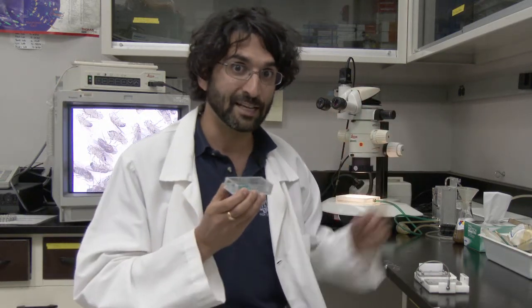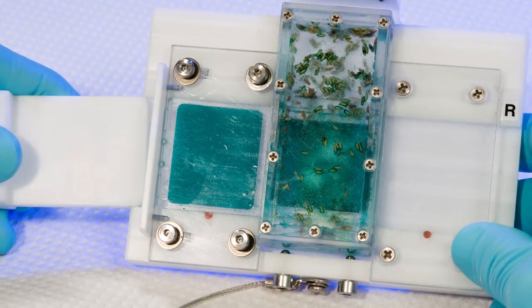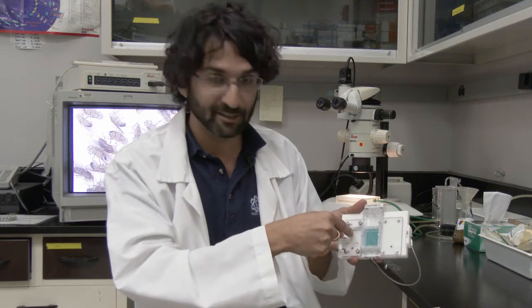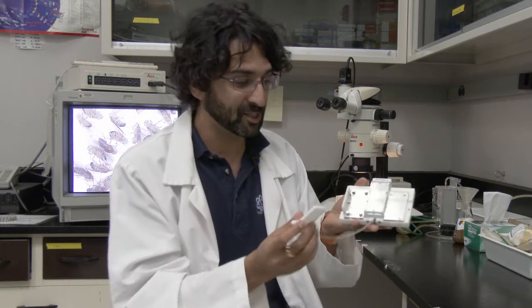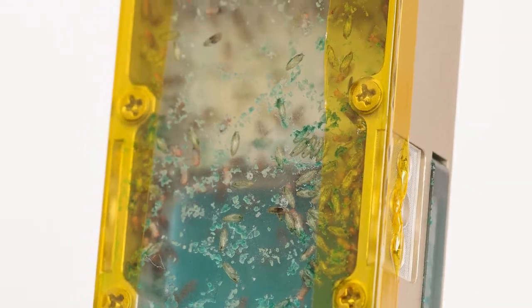So what we have done is built a piece of hardware like this. It's called a food changeout platform, which is specifically designed for the astronauts to change the food here quickly and efficiently. The way it works is that you put the cassette inside this changeout platform like so, and then a real changeout platform would have the new fly cassette in here. The new food in here. And then the astronauts will use this bar and push in the new food and pushing out the old food. This old food contains larvae of the flies, which we can then preserve for scientific examination back here on Earth.